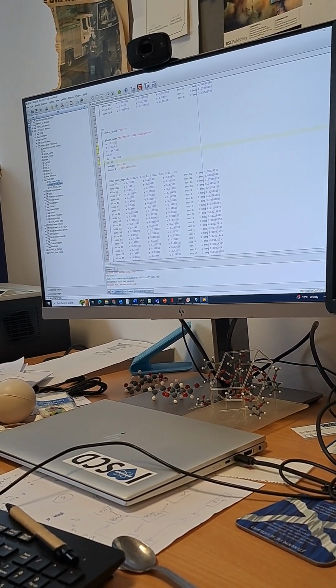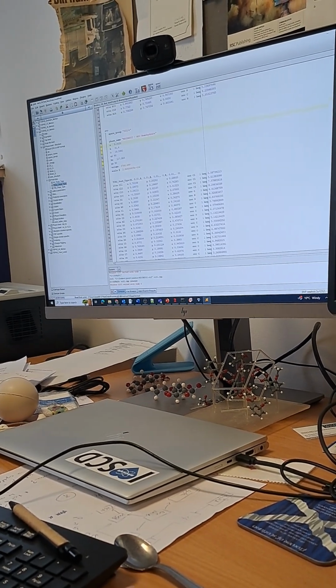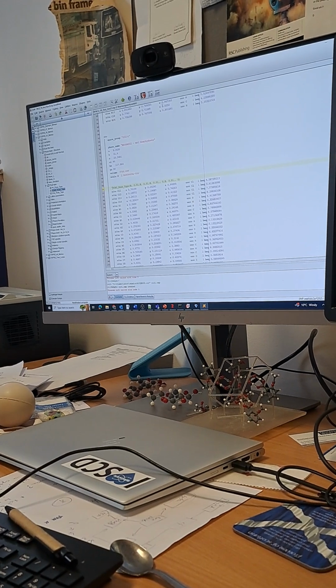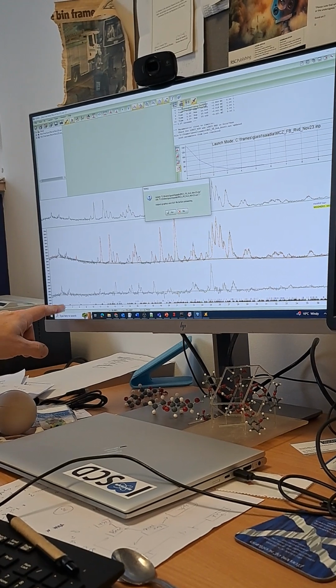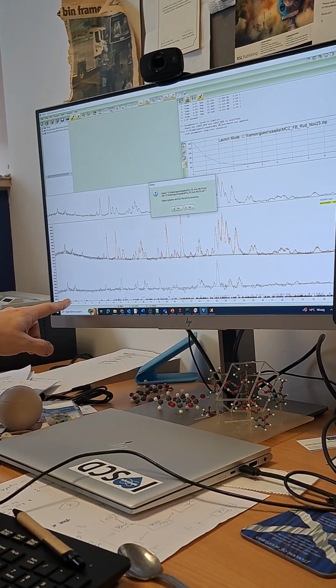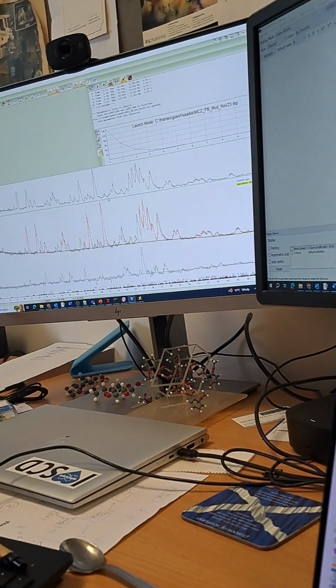We've edited this one because we want to get that peak there. So if I click on send, I'm going to just take this off for the moment. Send, and then have a look at where this goes. Right, okay, so we've sorted out the B-axis. The B-axis we are not going to change. That B-axis will be that value.